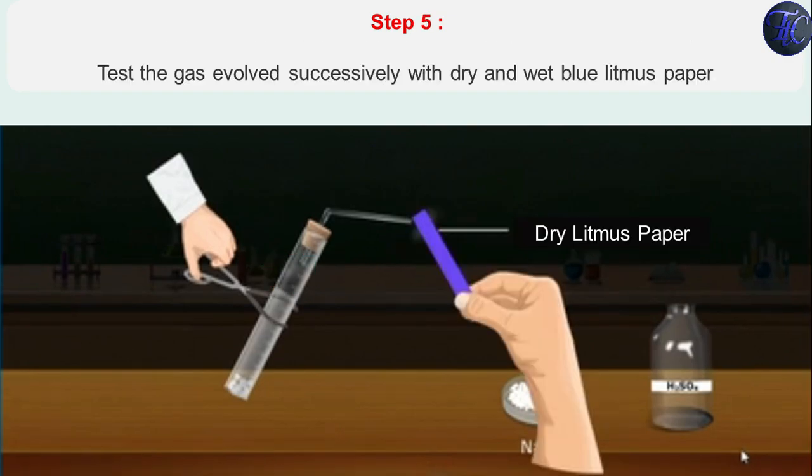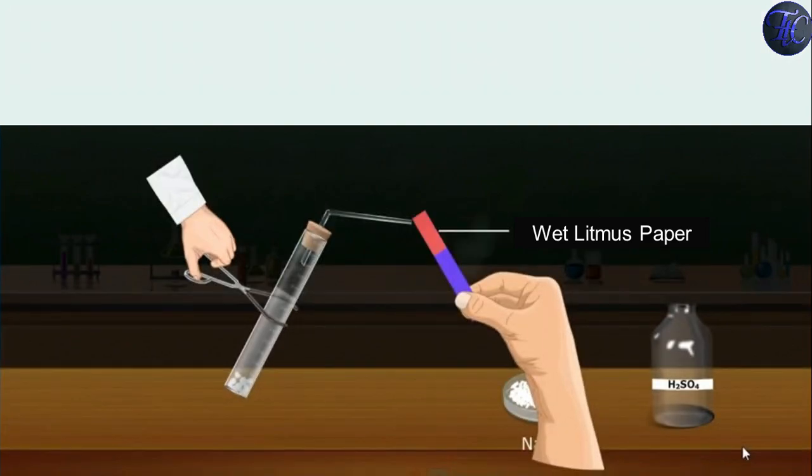Step 5: Test the gas evolved successively with dry and wet blue litmus paper. First take dry litmus paper near to the delivery tube from which gas is coming out. Did you observe any changes? No, no changes is observed. Now take the wet litmus paper near to the delivery tube. Did you observe any changes? Yes. Wet blue litmus paper is turned to red color.